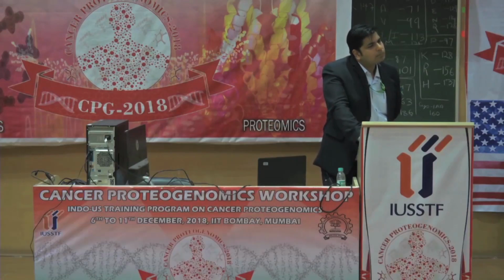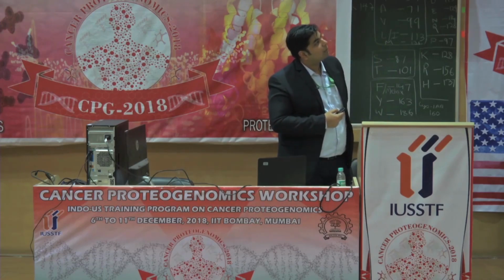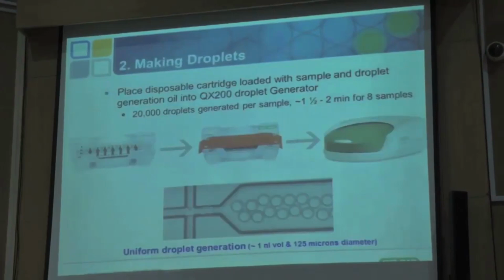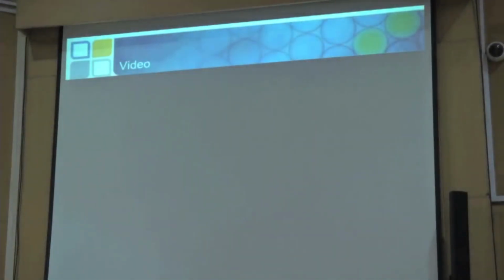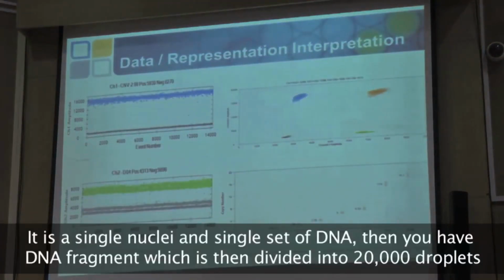Like in your video, when they... can you show me the first slide? This one? Which was separated the strands. Yeah, wait. I won't be able to forward the video yet because I can't see anything here. Tell me your query, ma'am. Like in that slide, you have shown that there is a single mutation in the gene, and when we have a DNA sample in a tube, it's getting separated into different droplets. That was the point. It's not one fragment, right? There are multiple fragments.